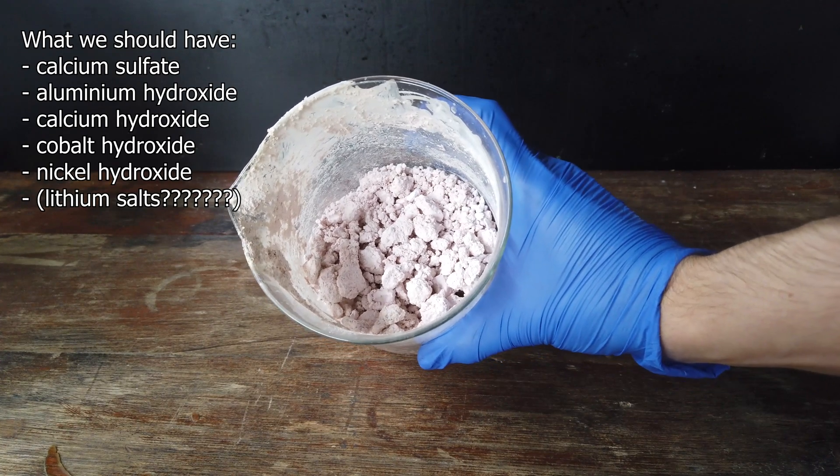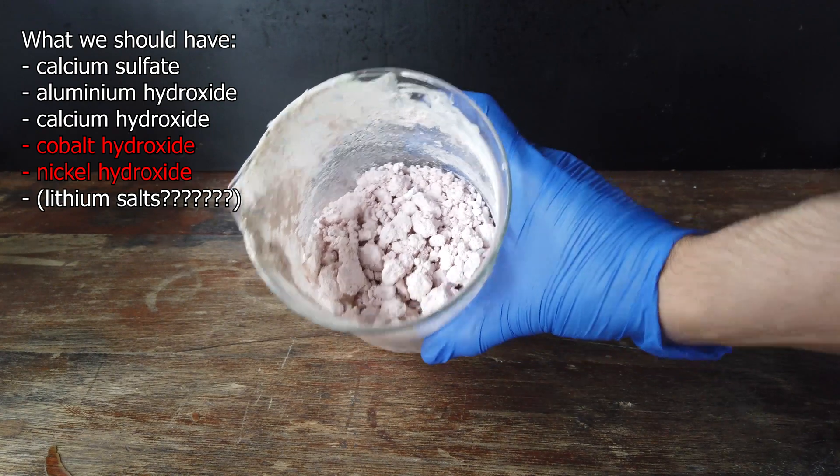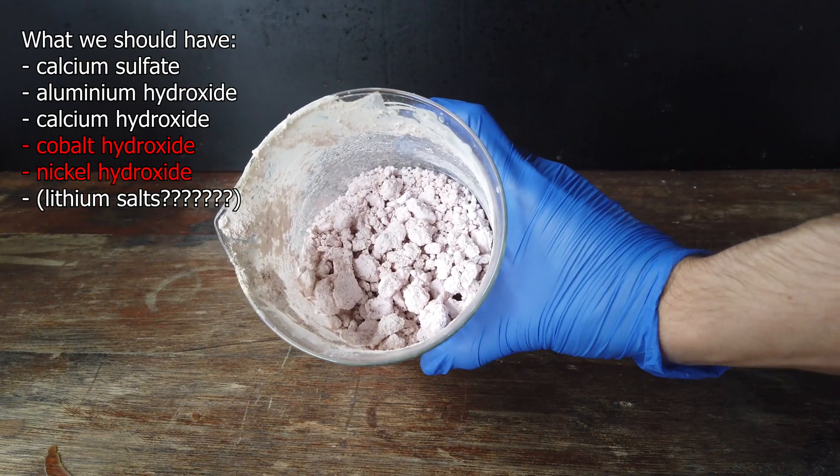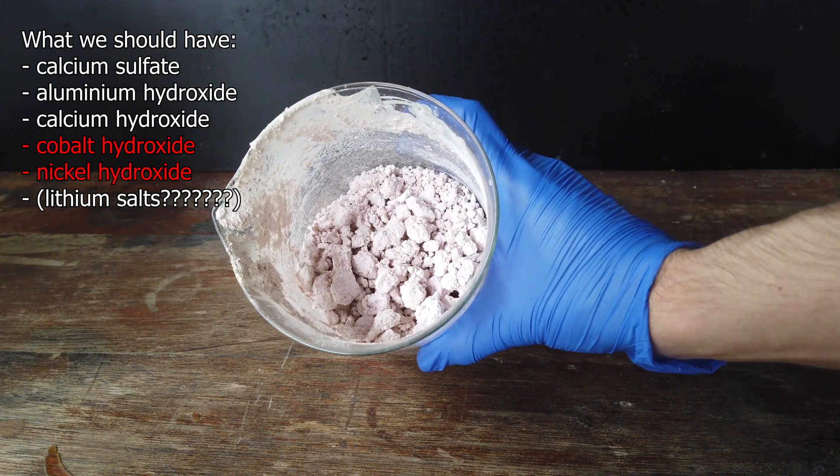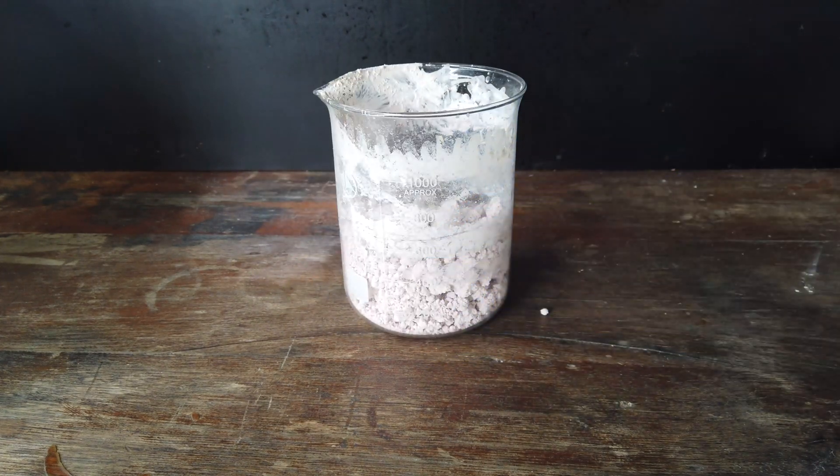So, the plan from here on is to extract the cobalt and nickel, and then eventually separate the cobalt and the nickel from each other, which isn't the easiest thing to do, but we are going to have a go. I think I've got a pretty good method of doing it.